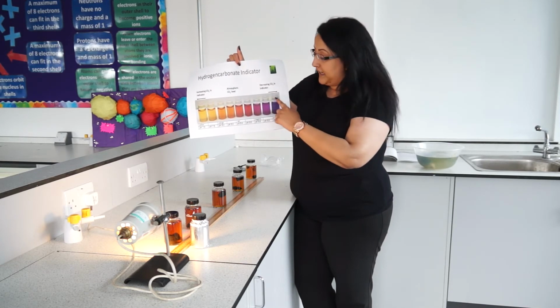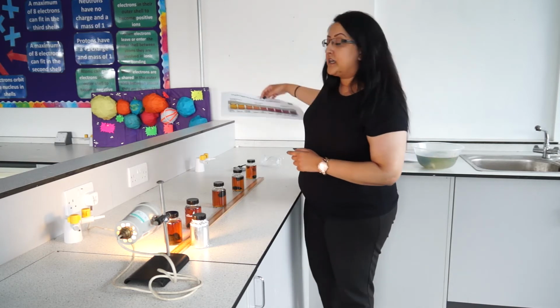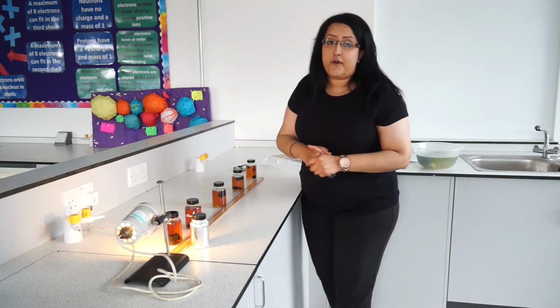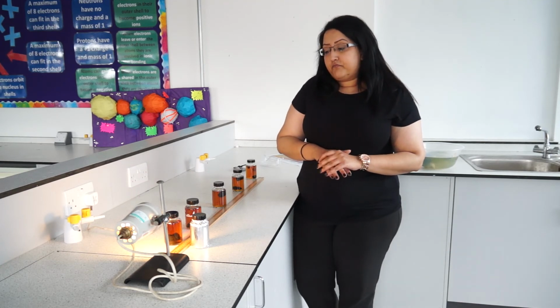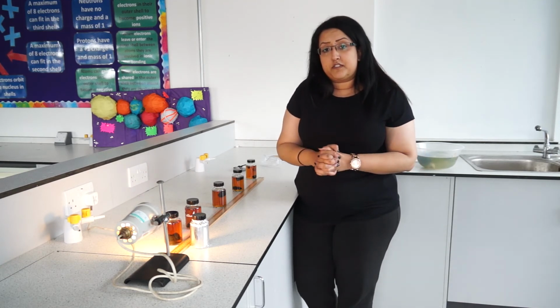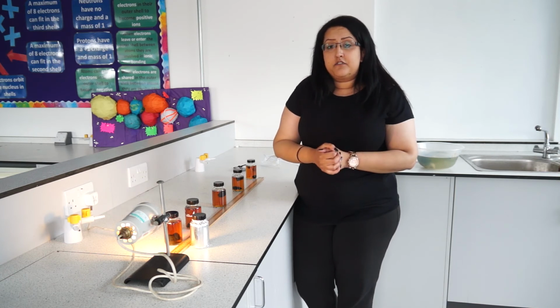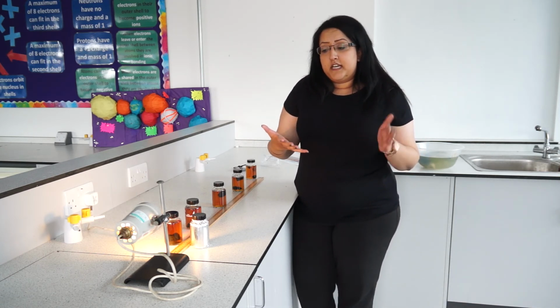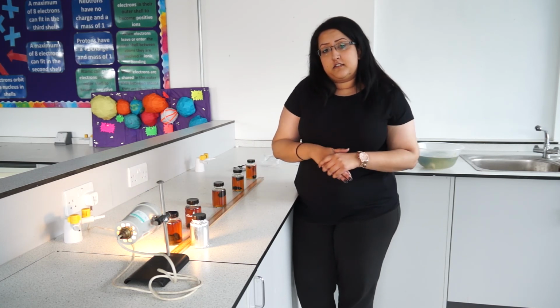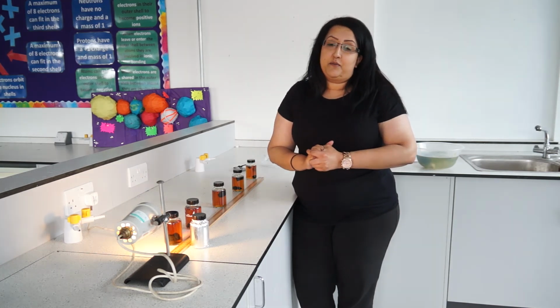You're hoping to see something this colour because the carbon dioxide has been used up for photosynthesis. One of them will have used a lot of the carbon dioxide because it is closer or further away from the light, and one of them won't have changed that much, and that is up to you to figure out why. Watch this a couple of times if you need a bit of help, and ask your teacher if you need any help. Okay, thanks.